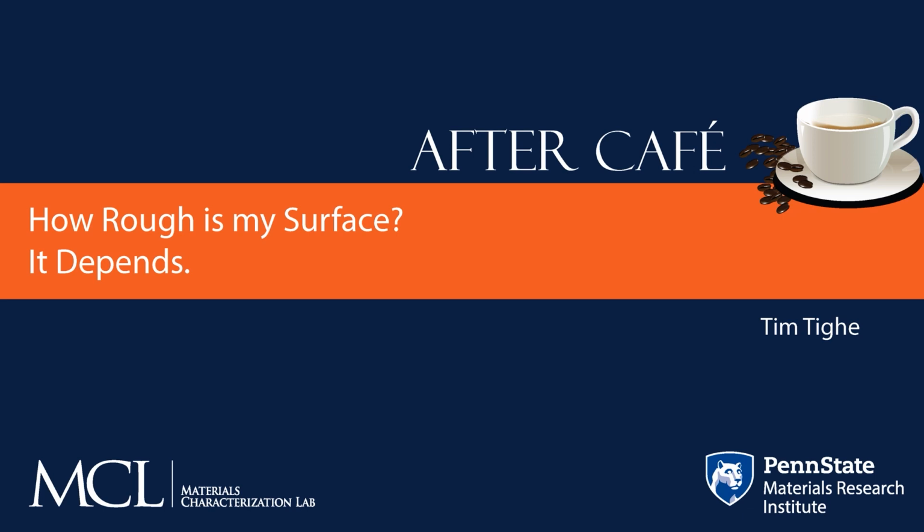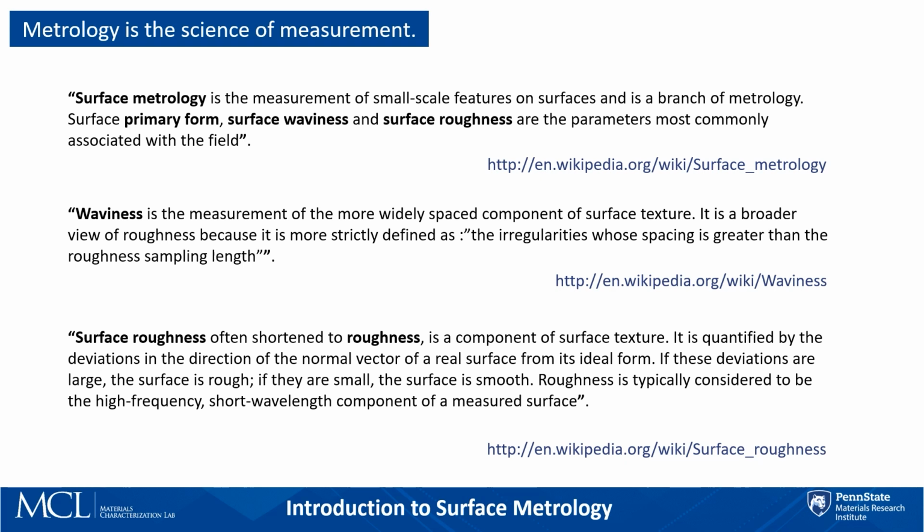By the end of this talk, you'll see that it's going to depend on the technique that we use to measure that surface roughness and the conditions under which we measure the surface roughness. Before we can talk about surface roughness, we have to define surface roughness.